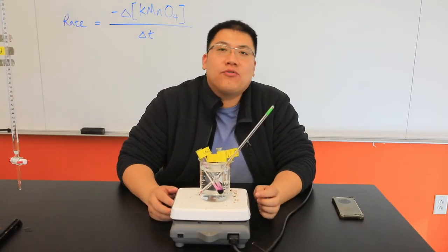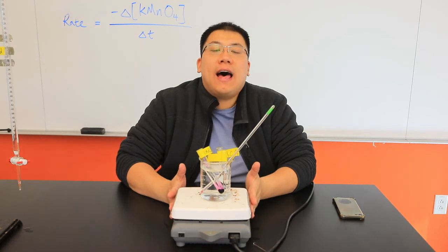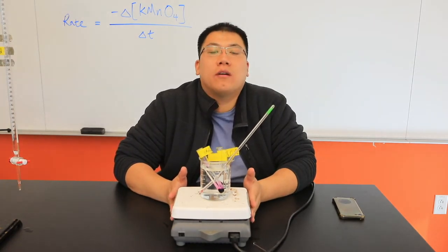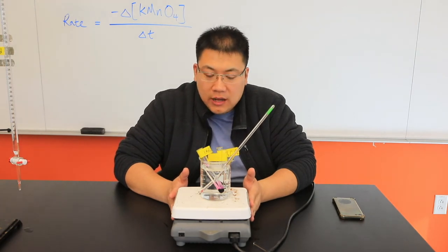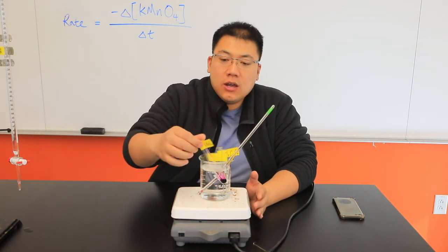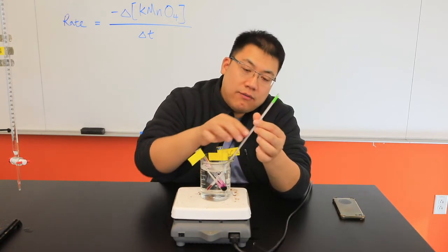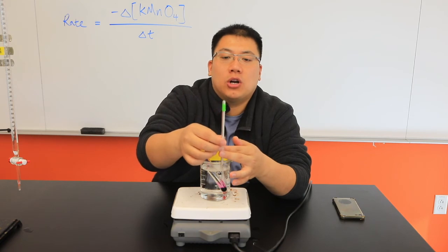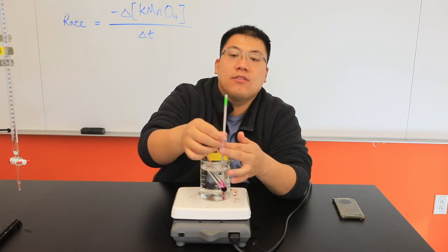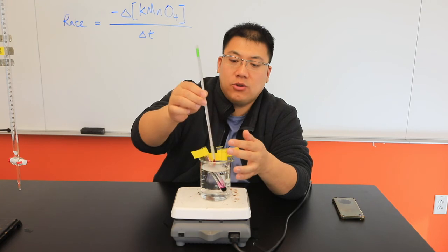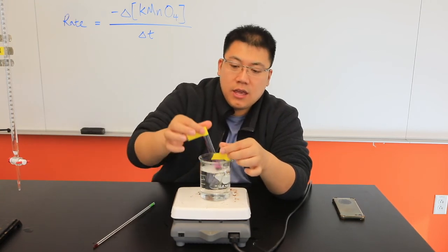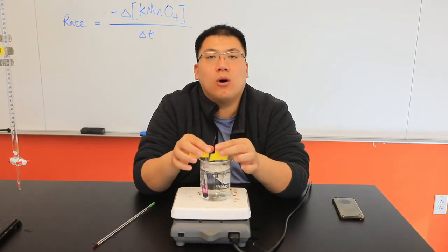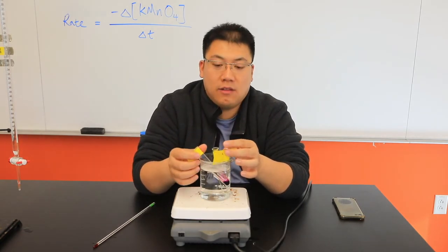I decided to demonstrate the rate of reaction at the elevated temperature. This is actually for determination number 6. The instruction asks us to increase the temperature about 30 degrees above the room temperature. Right now, the water bath temperature is at 55.5 degrees Celsius. I'm actually going to take this out. In each of the test tubes, I have already measured the required amount of water, oxalic acid, and potassium permanganate.